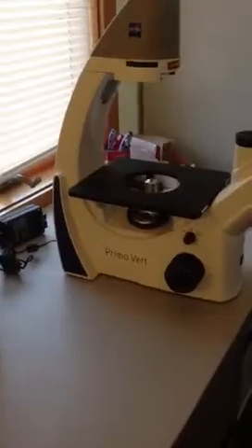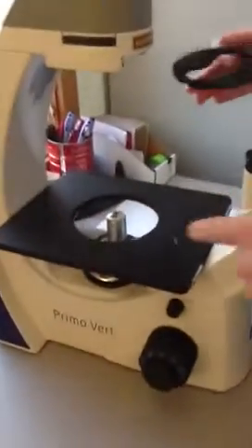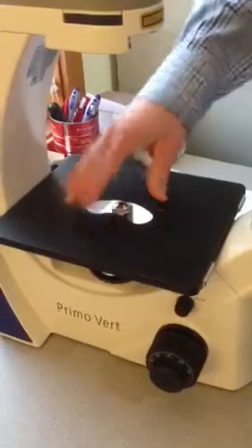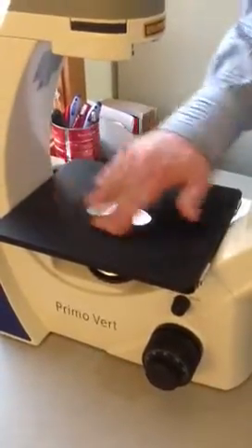Next you can install your stage. This side with the bump on it goes down. The bump goes into this little groove, so you just push it in there and move it around until it clicks. This should be all level.